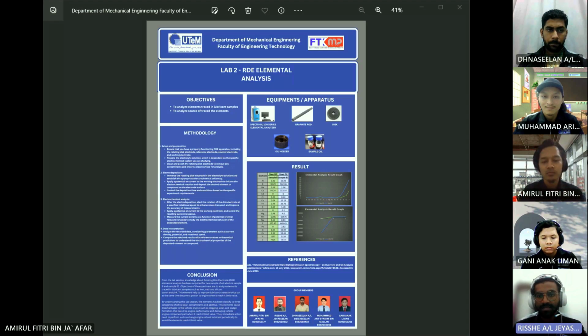I'll start off with the introduction to our topic, which will be the spectroscopy technique for detecting and quantifying elements in materials. Each element has a unique atomic structure, used in lubricant analysis to detect worn metals, additive element levels, and contamination in oil. Fine particles are generated by relative motion of metallic parts in an oil-wetted system.